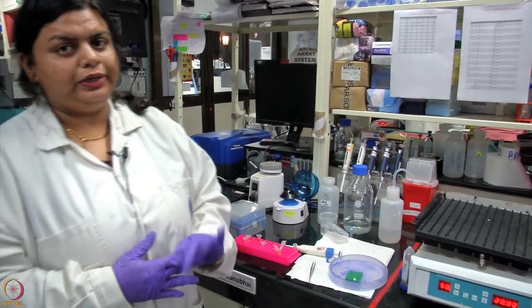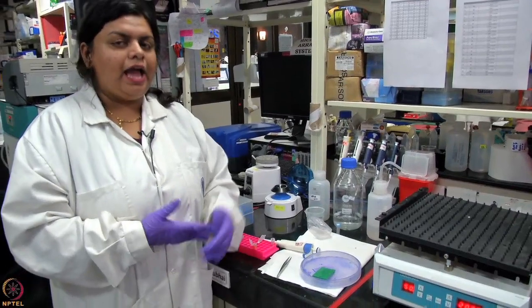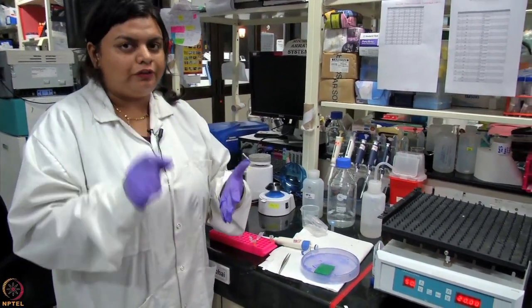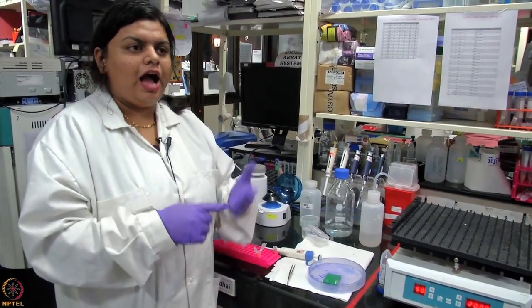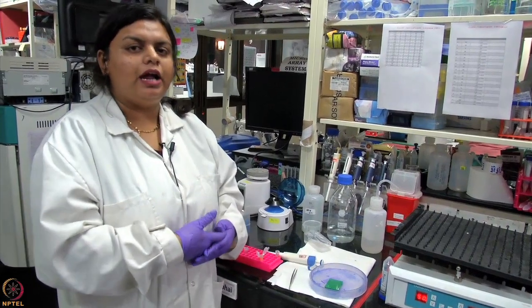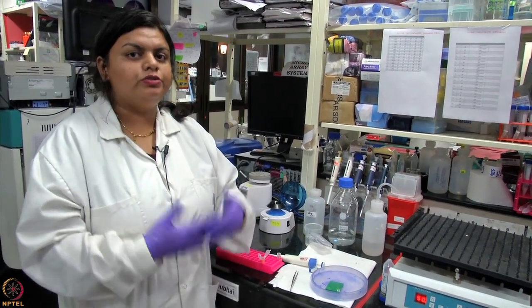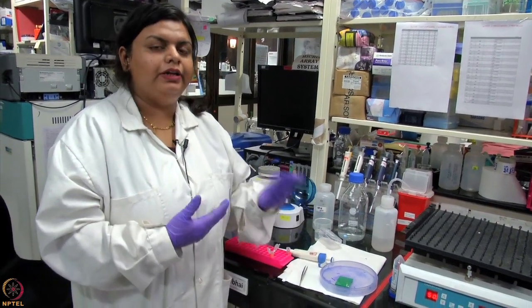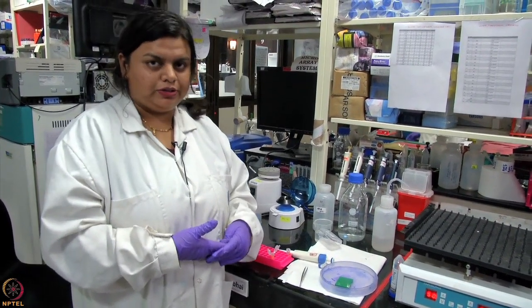After that, we ran the sample in the gel and excised the bands, and these bands were cut into small fractions and digested. After digestion, we have separated the peptides, and these peptides would now be injected into the mass spectrometer to see what other proteins have interacted with our protein of interest.